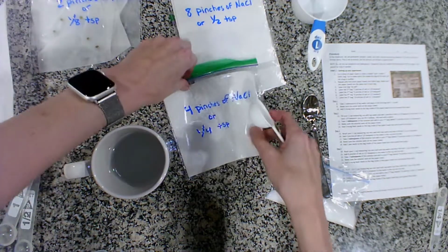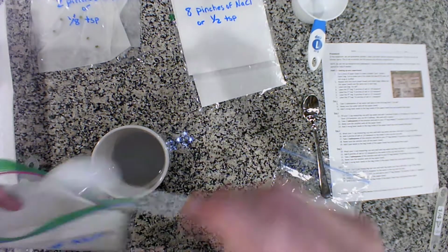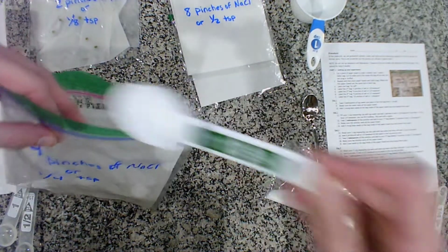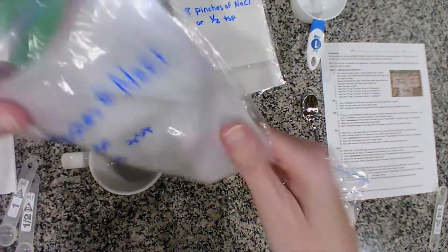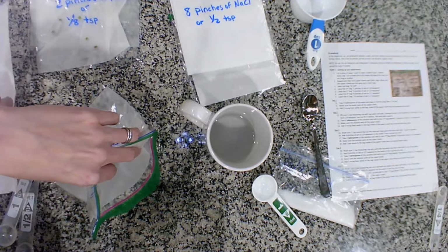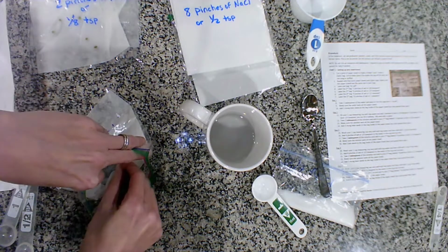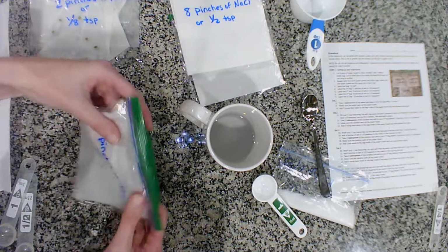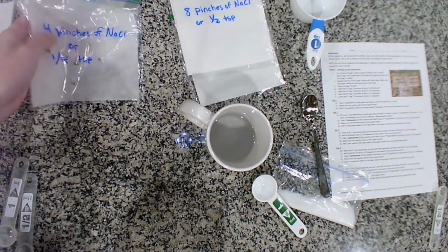All right, 2 tablespoons of this salt solution. I'm going to keep my finger in the paper towel this time so I can open it easier. Just a trick. All right. Now it's time to put my 5 mung beans in here. 1, 2, 3, 4, 5. Aha! That actually worked out really well. Okay, make sure you squeeze all the air out, and now I have my 4 pinches, or my 1/4 teaspoon.